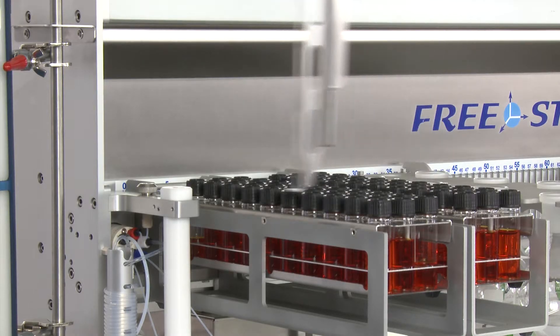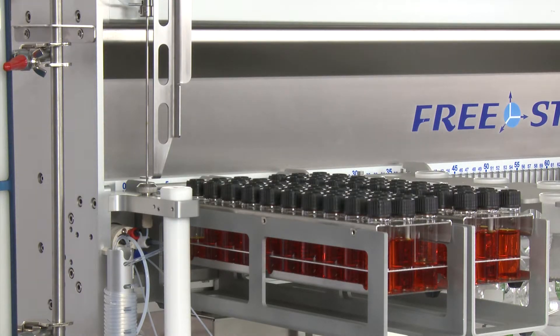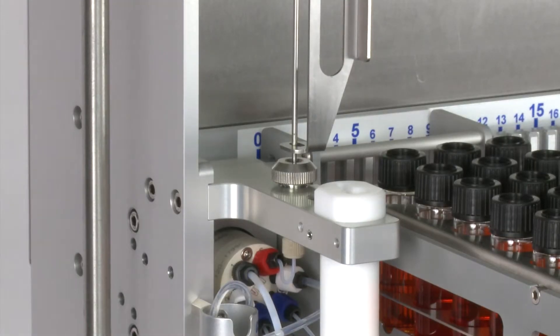In order to avoid cross-contamination of subsequent samples, the system is rinsed after each run.